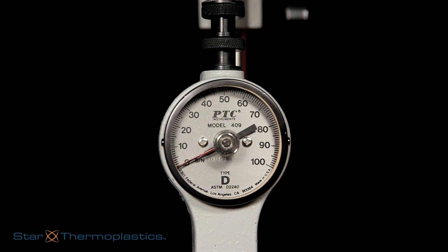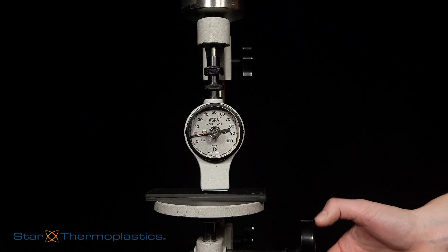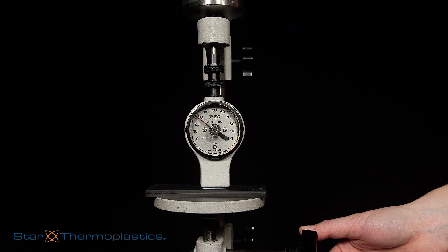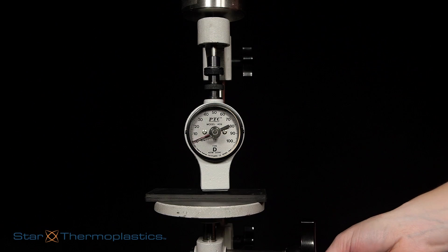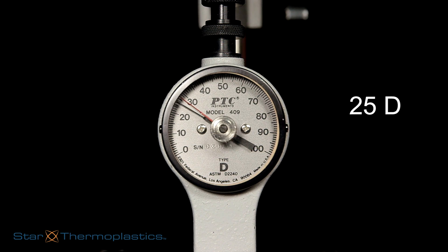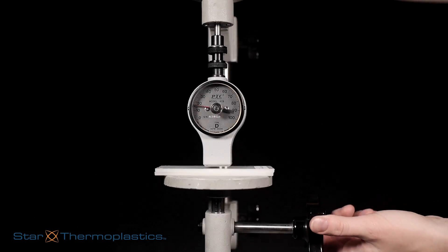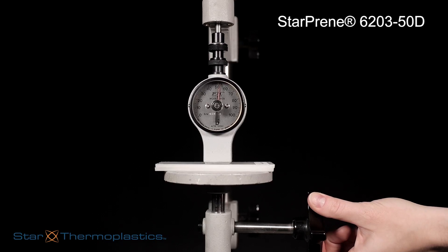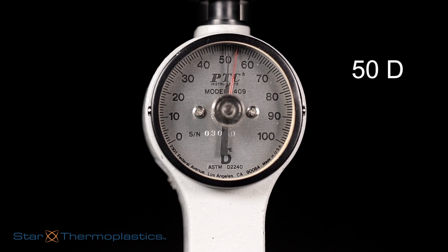All of our demonstrations will be on the Shore D and Shore A scale. As you can see, this material typically used in automats has a hardness of 25D. Sometimes the Shore scales overlap — for example, this Star Thermoplastics TPE measures 25 on the D scale but measures 88 on the A scale. One of our harder materials, Starpreen 6203 50D, measures 50 on the Shore D scale when tested.